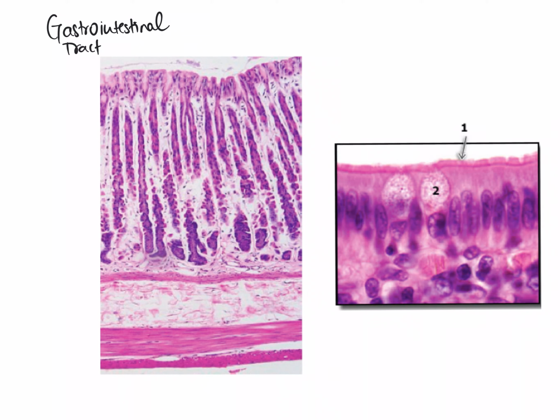So Daniela, here we have a histological section of the stomach on the left. What can you tell me about the structures that you see? All right, great, Beth. So you know it's the stomach because we're seeing these gastric pits that are forming. So you're seeing the epithelium sort of dip into the layer. But again, as I said, we're not really specific at this year level on identifying where we're at. What we really want to see is identify the features that are common to every area of the gastrointestinal tract. So here, let me just get the right tool on.